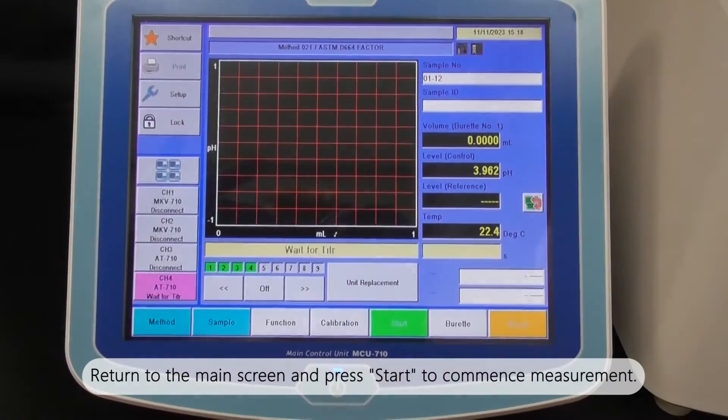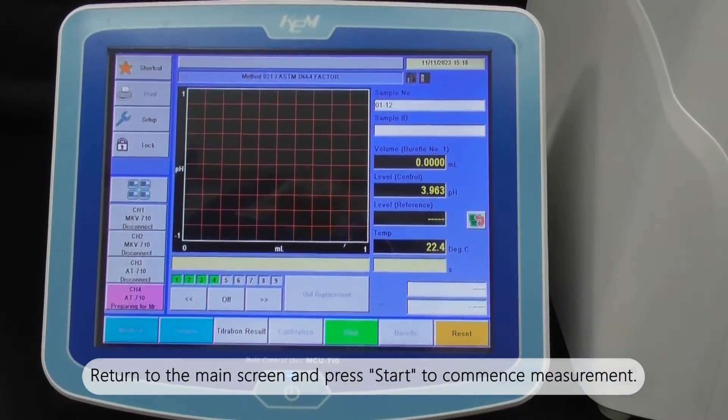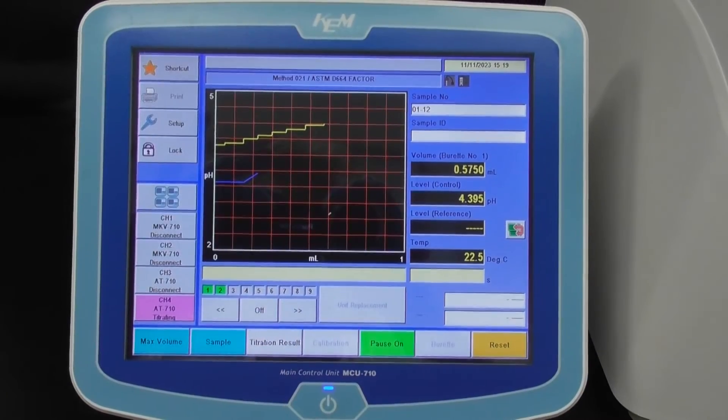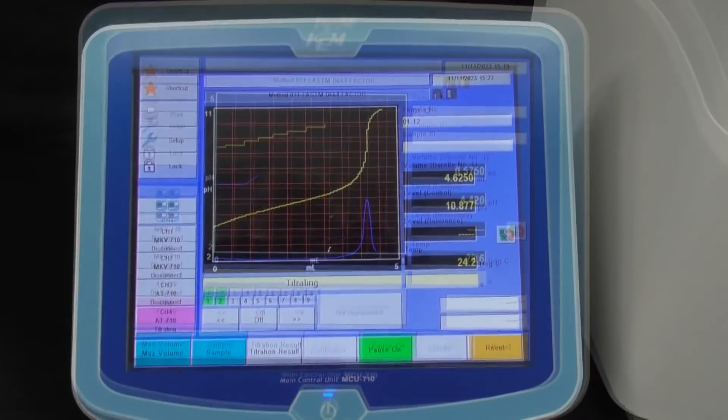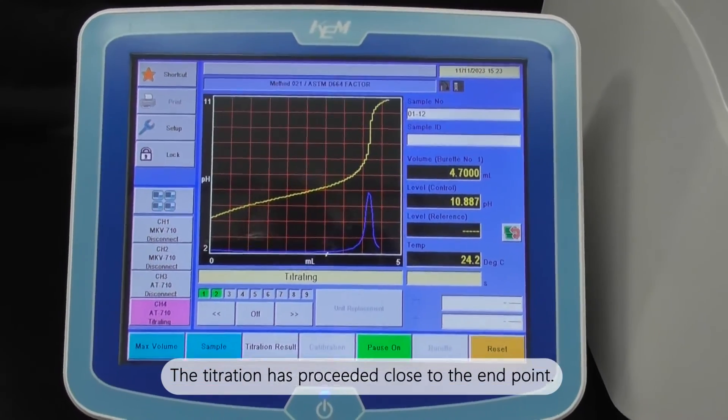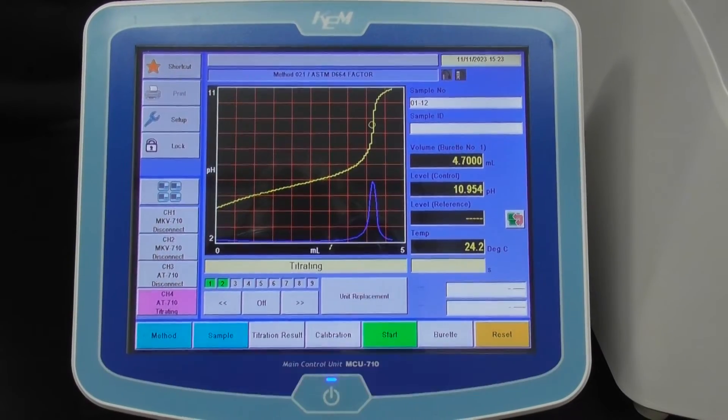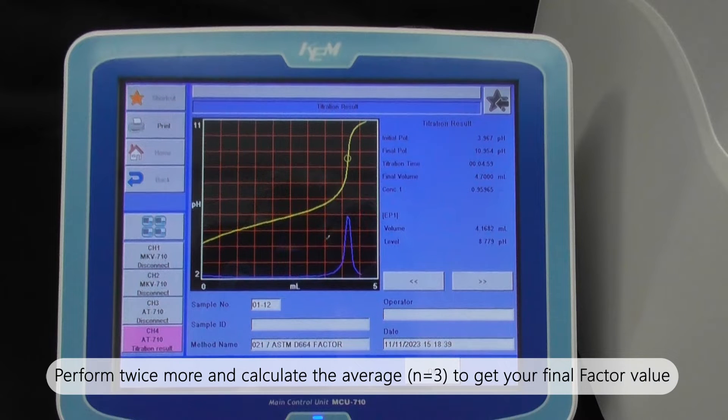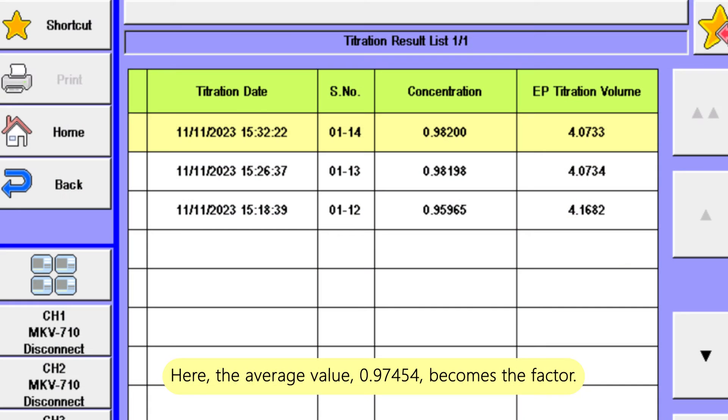Return to the main screen and press start to commence measurement. The titration has proceeded close to the endpoint. The result is displayed when reached. Perform twice more and calculate the average to get your final factor value. Here, the average value 0.97454 becomes the factor.